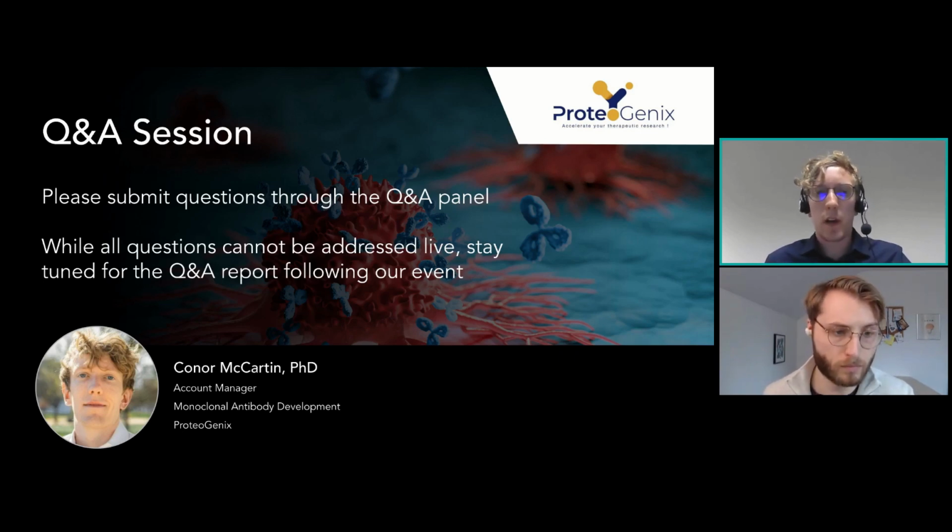The freeze-thaws are very, very severe on phages. We can lose 10 to the 10, a power of diversity, with one freeze-thaw. So this is absolutely something to be avoided, and it is probably better to stock phages infected in the bacteria and freeze that.